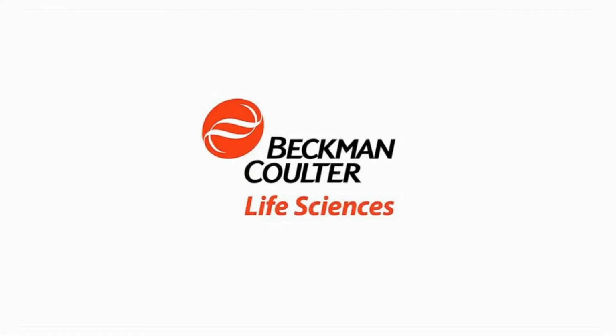Yeah, thanks. Can you hear me okay? Yes. Oh, great. So there's quite a bit of setup for several of these systems. The DNA purification system in particular is quite involved due to the fairly large number of labware that are required for runs. Some systems take 10 to 15 minutes, while that system takes upwards of a half hour, possibly a little bit more, to set up.